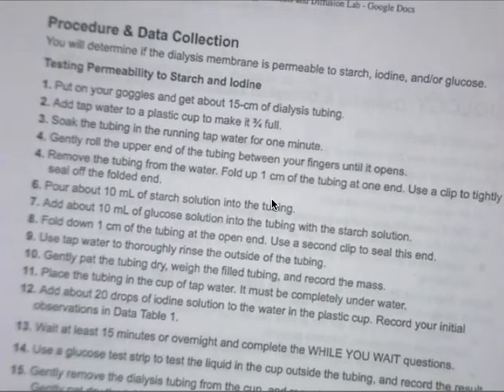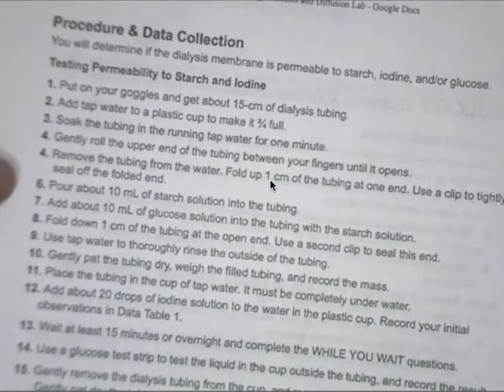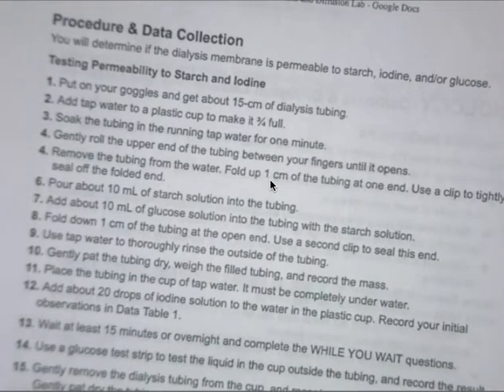Number four A, I guess. Double four, maybe. Remove the tubing from the water. Fold up 1 centimeter of the tubing at one end. Use a clip to tightly seal off the folded end. We'll skip, that's supposed to go to 6 now. Right here, it says pour about 10 milliliters of starch solution into the tubing. Number 7, add about 10 milliliters of glucose solution into the tubing with the starch solution.